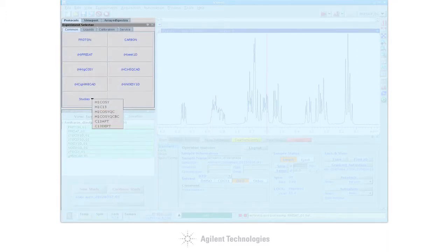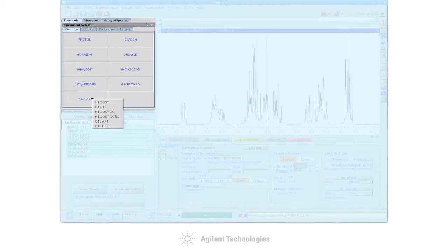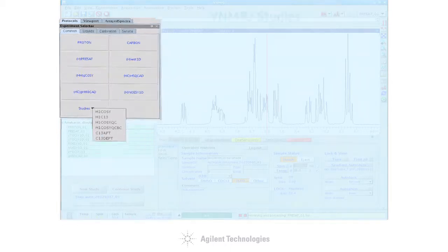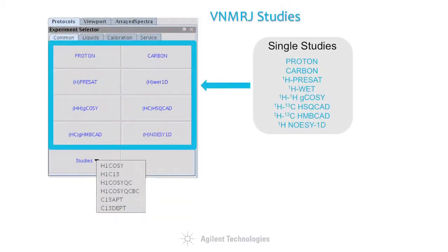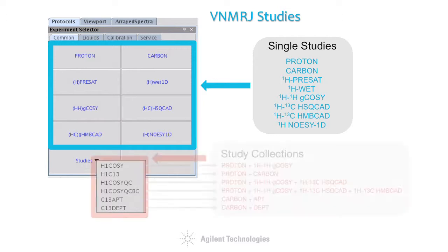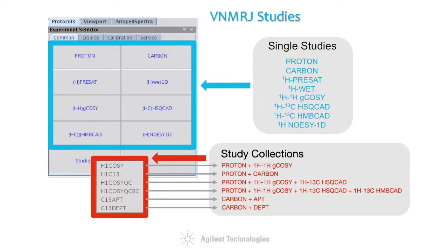The building blocks for the study queue are studies that can be selected in the experiment selector by a simple mouse click. A study may be as basic as a single experiment or pulse sequence but may also consist of a complex collection of requests including an arbitrary number and combination of simple studies.